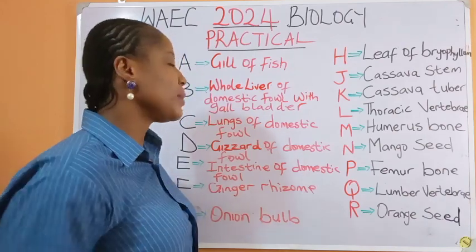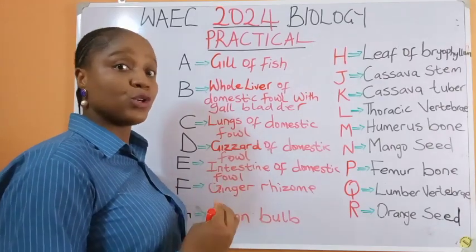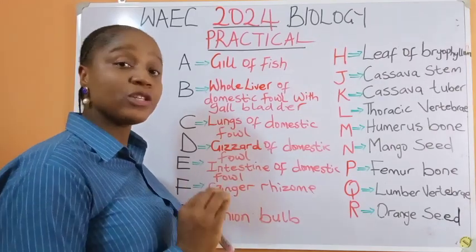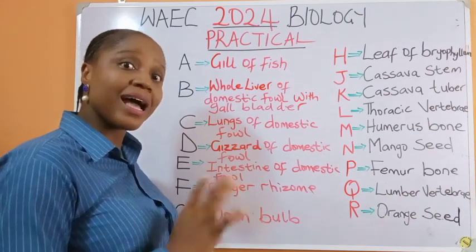So today, these are the specimens that you should be expecting on the day of your practicals. I'm going to drill you on how to identify each of the specimens and then some relatable questions that can be asked on that day.